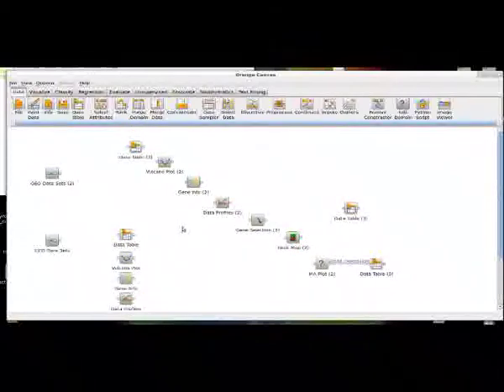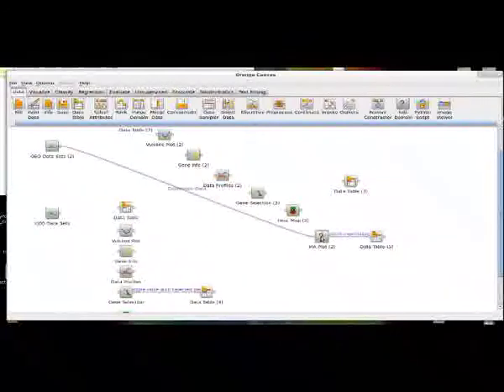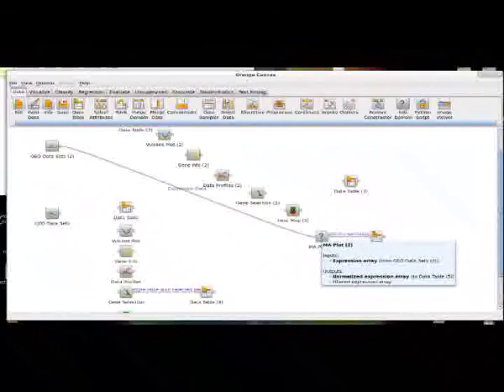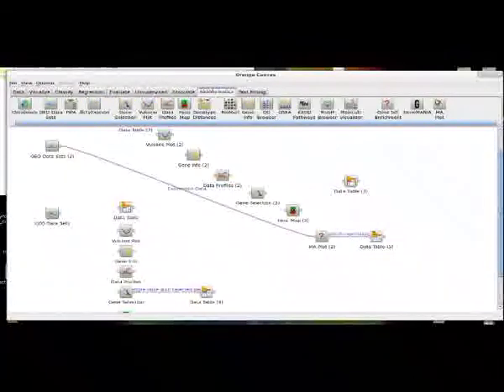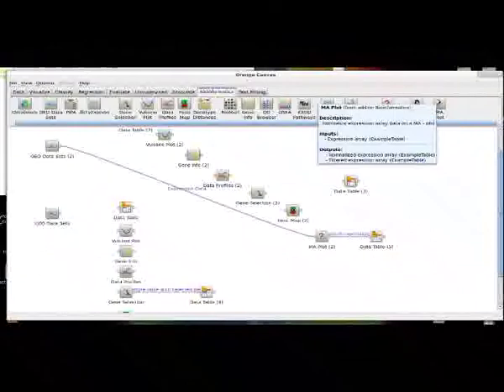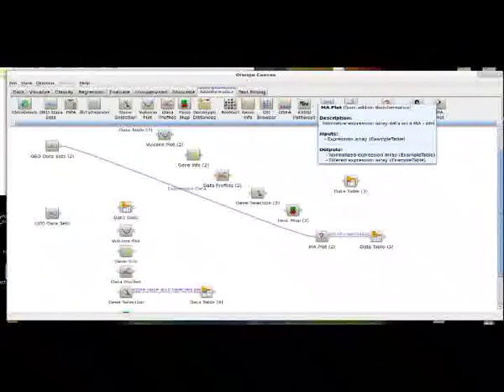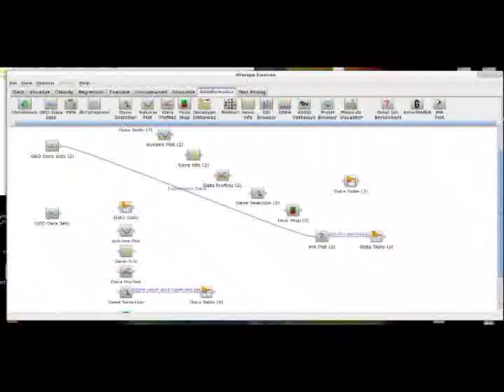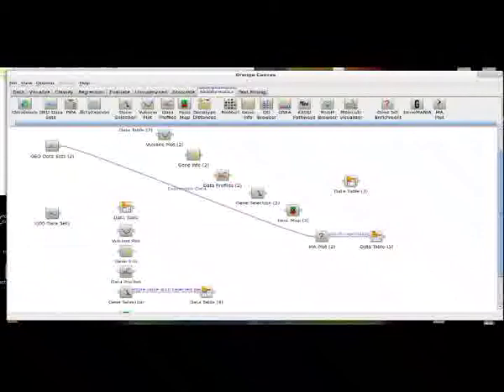So that's all I'm going to say about heatmap, how temperamental it's being. So the last thing, I'm going to show MAPlot. What is MAPlot? Let's see what it has to say. Ah, it has a better description up here, I believe. MAPlot. So normalize expression array data on an MAPlot. So for anyone who has ever had to deal with microarray data, you'll know that normalizing the luminosity readings from the different cells of the microarray is one of the most common problems the bioinformatics face. When you get that expression level data back, you're going to have numbers from 0 to 1, and you're also going to have numbers up in the 700s and the 1000s.